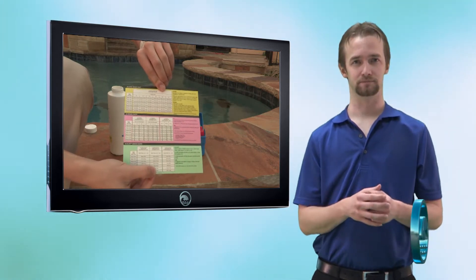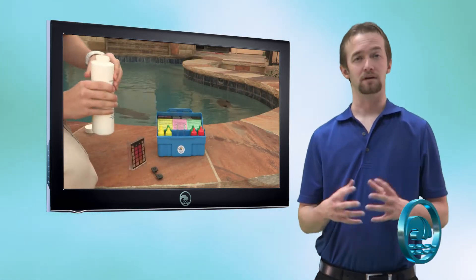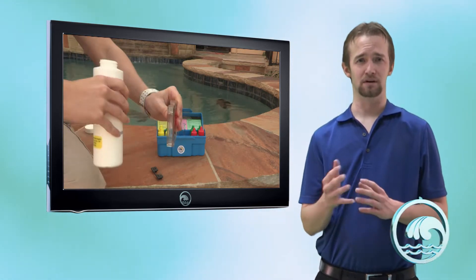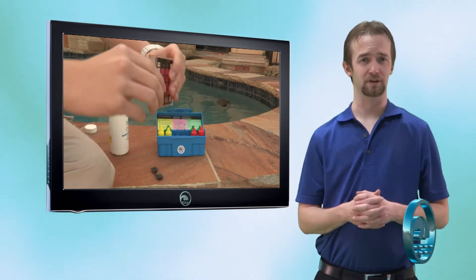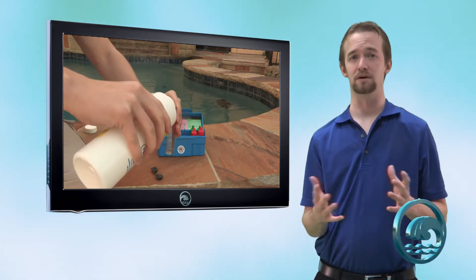Very simple to use. The first thing we're going to do is take the plastic comparator and use the chlorine compartment, which is located on the left. It has Cl and Br next to it — Br stands for bromine, Cl stands for chlorine. The chlorine column is the one we need to pay attention to, unless you have a bromine system, which is kind of rare, in which case you'll want to look under the Br column.